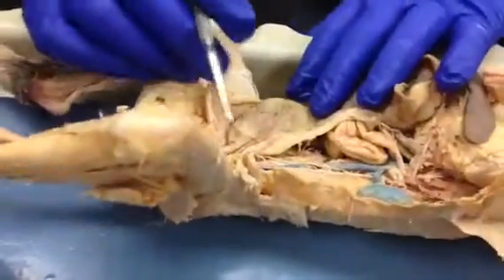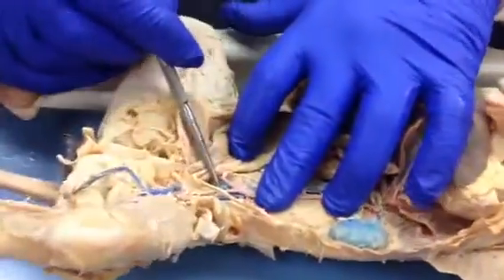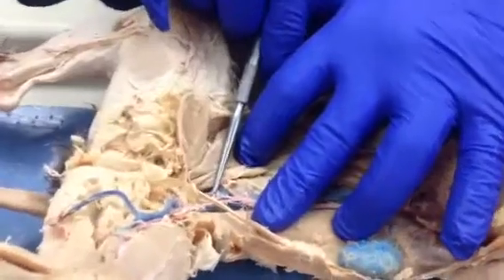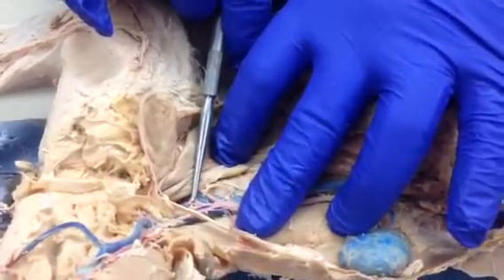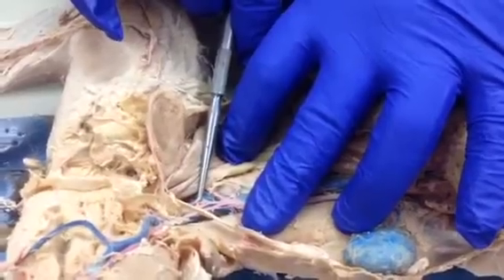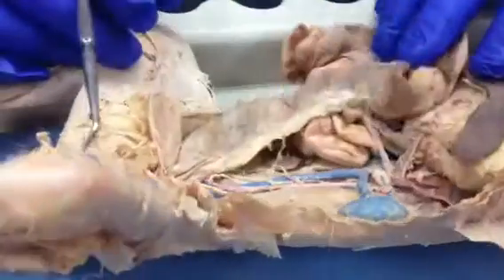The other artery that goes straight on through, like it's a continuation of the aorta, is the sacral. I think your book lists it as the caudal. It's not quite caudal yet because it's not out the tail yet, but that's where it's heading. It's heading out to the tail.